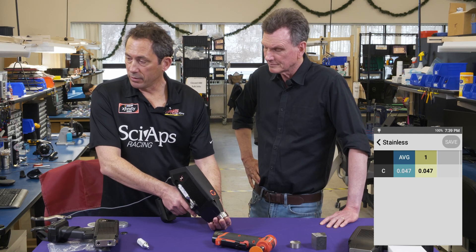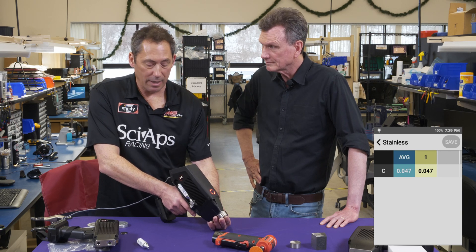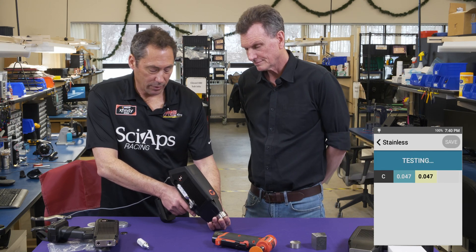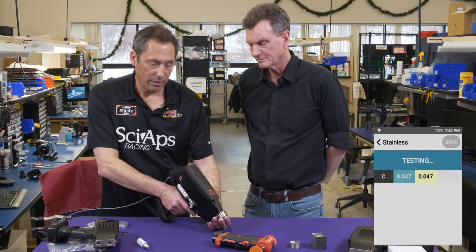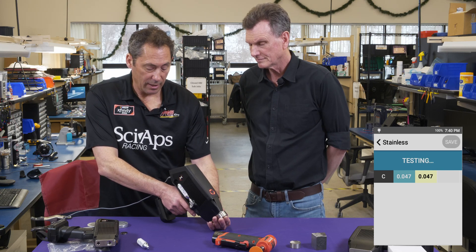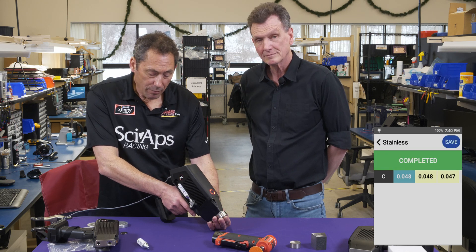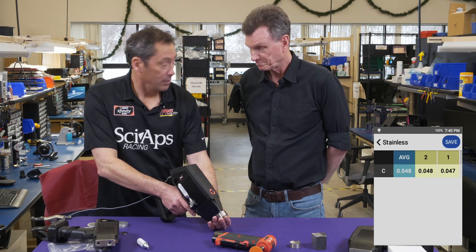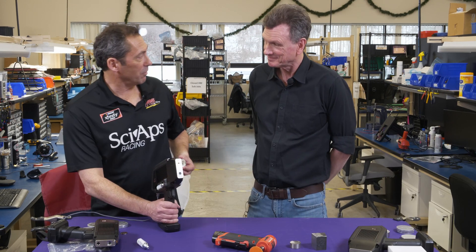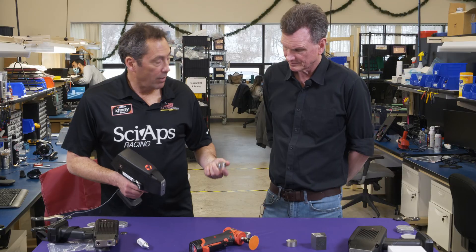It comes up 0.047. This is a straight grade stainless, so it knows it's stainless but it doesn't say the grade because it's only measuring carbon — without nickel, chrome, and moly you can't identify what stainless it is; that's what the XRF is for. Let's do another test: another pre-burn, another test. In blue is the average and in yellow is each successive reading. The second test came in at 0.048 — very good repeatability.